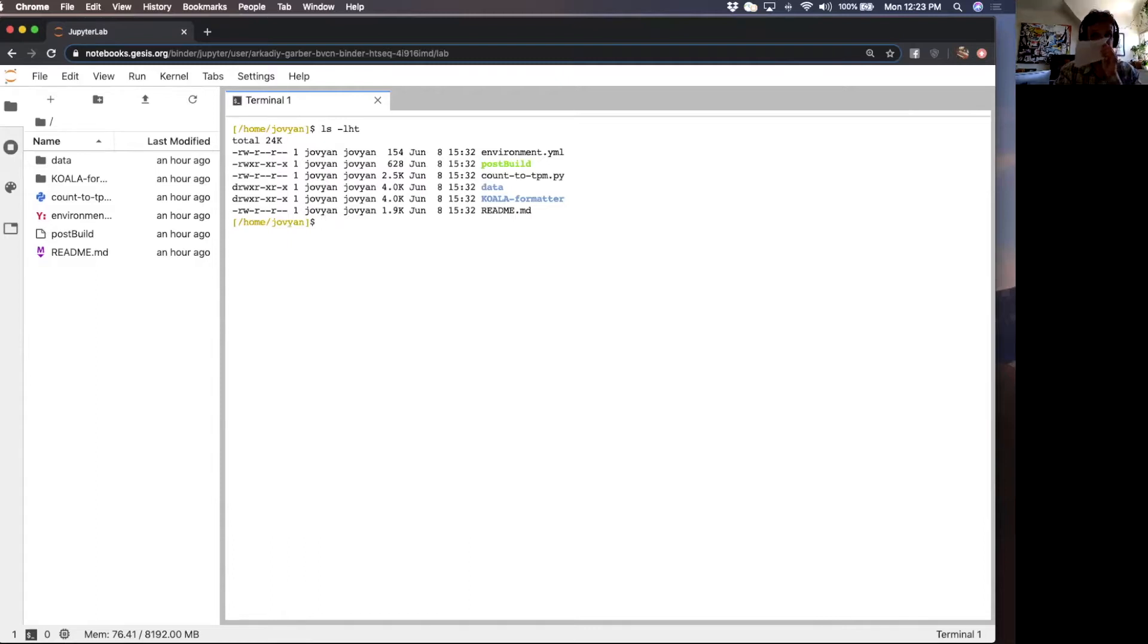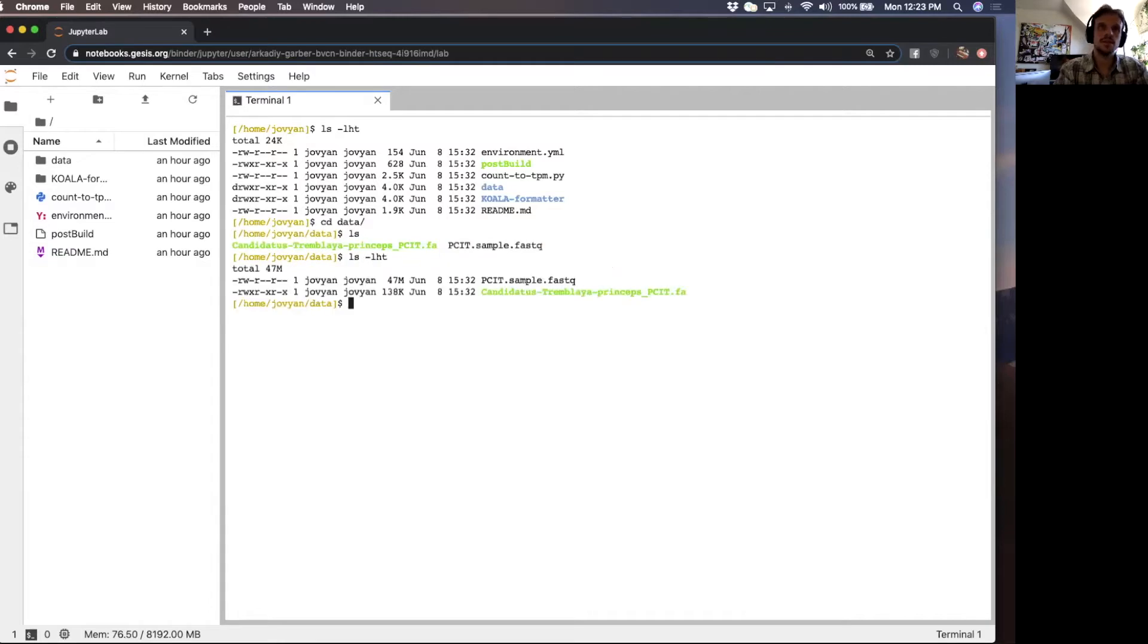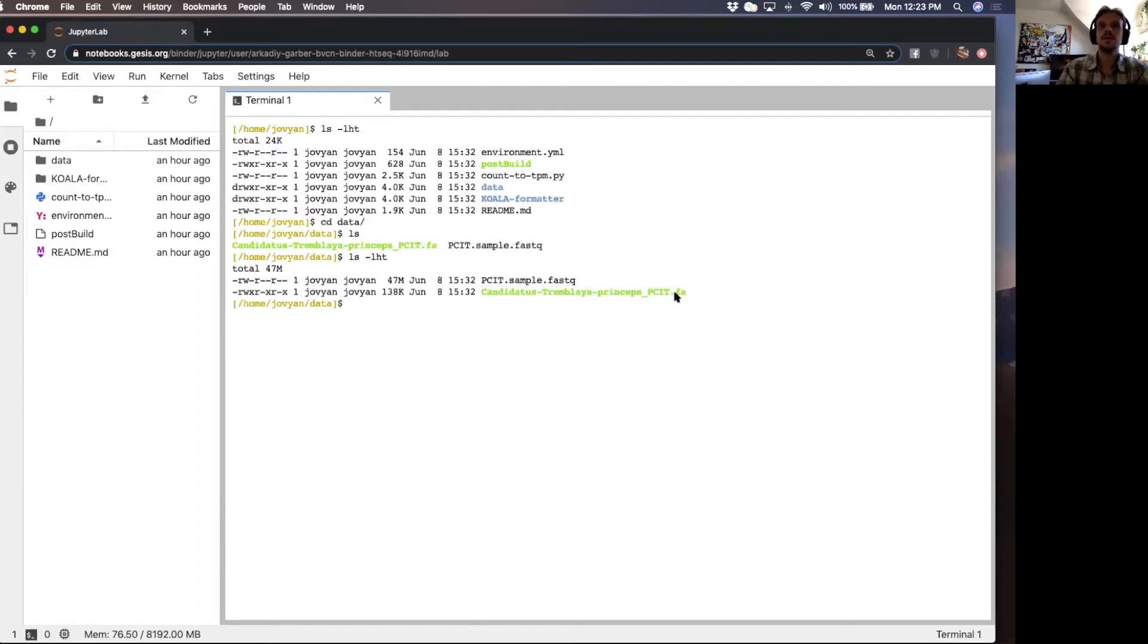We have a bunch of files. The main files that we want are in this data folder. There are two files here. The Candidatus Tremblaya princeps PCIT.fa, this file is a genome.